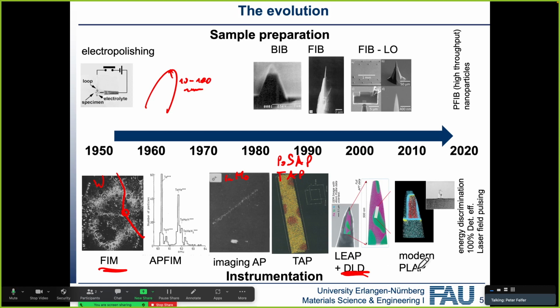And in the early 2000s, modern lasers came into play, essentially picosecond and femtosecond lasers. And then further developments went to shorter wavelengths and so on.